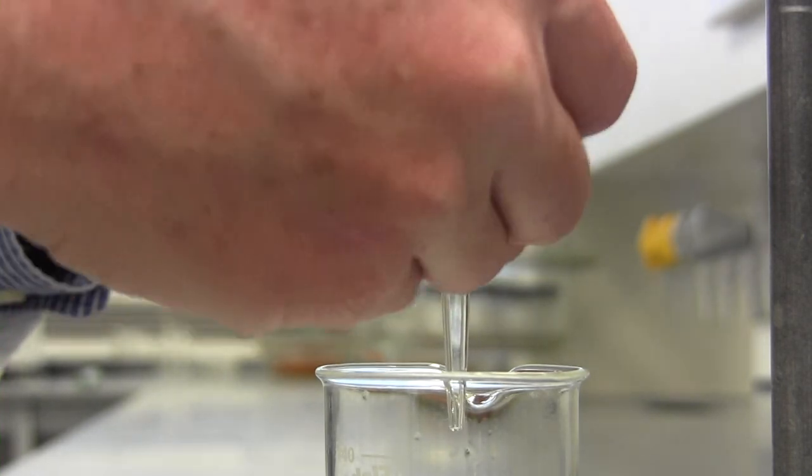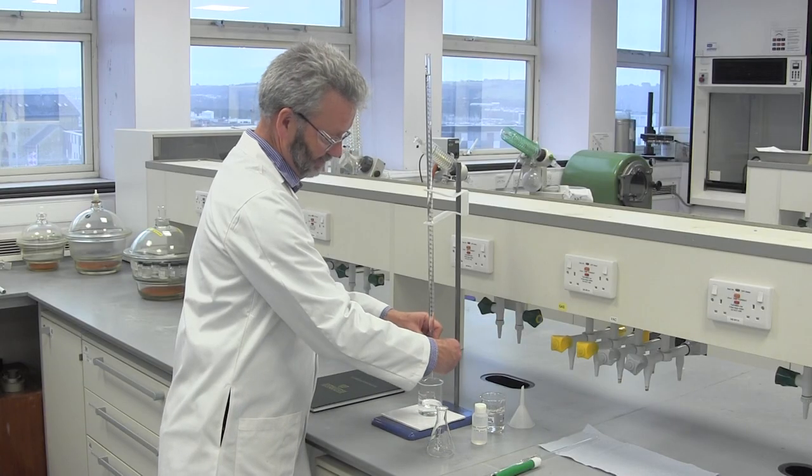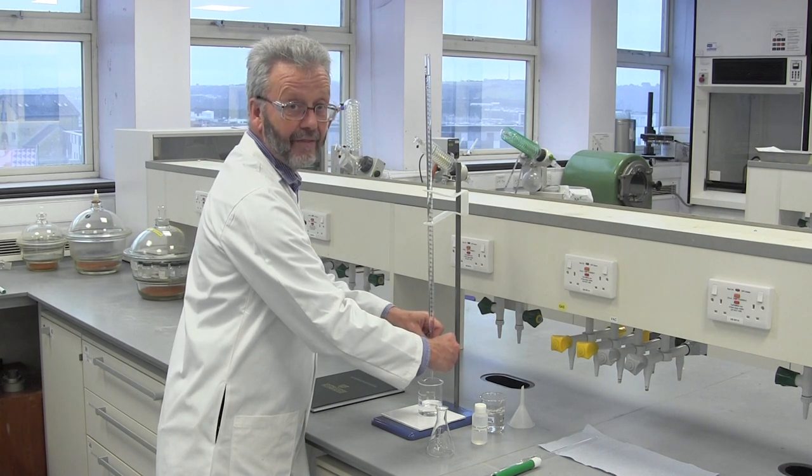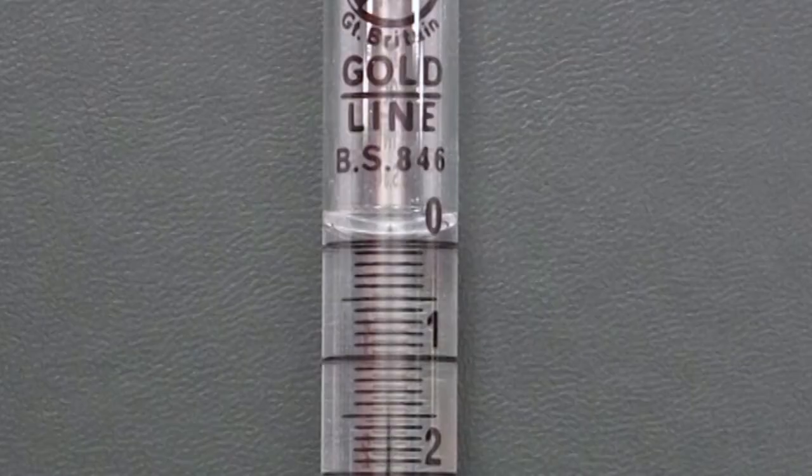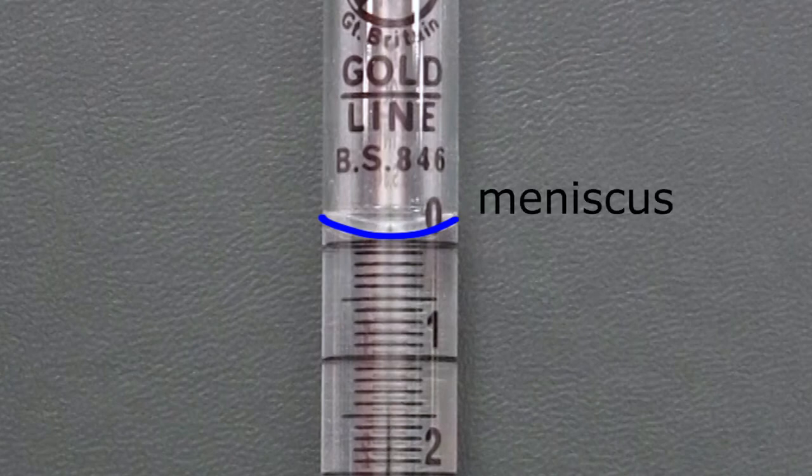We can now open the tap carefully to allow the level to fall slowly. An important point here is that in a narrow tube like this, a water-based solution will exhibit a pronounced meniscus — that is, the water will be attracted up the side walls of the tube, making the top surface curved. We always take readings from the bottom of the meniscus, so we must make sure that this is what sits at the zero line on the burette. That's the sodium hydroxide solution set up.